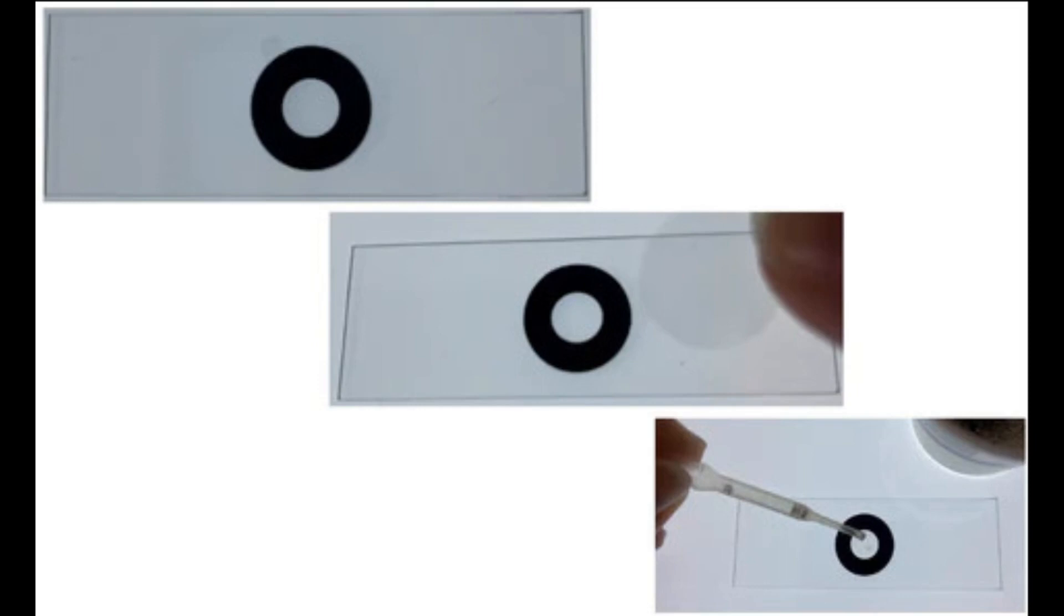You can find pictures and videos of microorganisms swimming in drops of water on the Microcosmos or on Foldscope's YouTube channel.